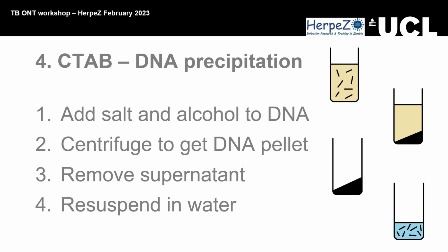So we're currently working on a modified CTAB method. The CTAB bit is there, but instead of doing ethanol precipitation, which is obviously leaving something in there with it, there's a spin column step instead, so it's purifying it in a slightly different way. Hopefully in the next few months we'll be able to say whether that really works or not. At the moment, it doesn't affect the ligation kit for Nanopore, so it's definitely something to do with the transposase that binds the barcodes to the DNA, we think. So yes, CTAB, excellent, but can be improved.